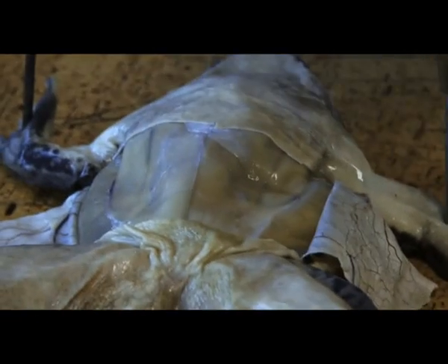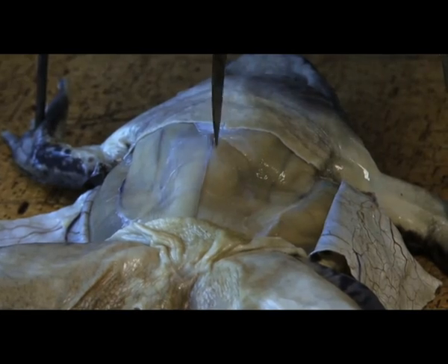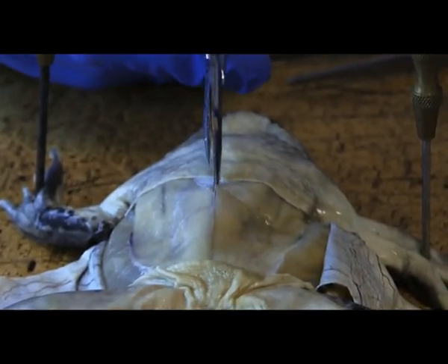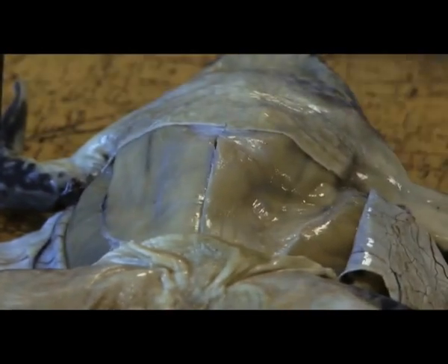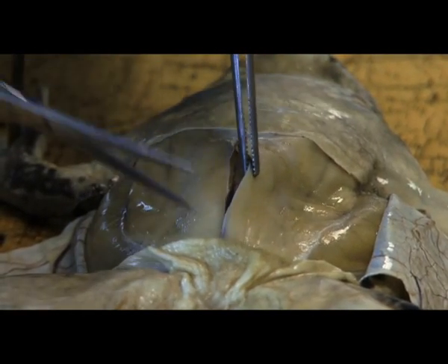We do the same principle again — a very, very thin cut, a small incision, and then straight down the vertical plane. As neat as you can get it; the neater it is, the better you will be able to expose the organs on the inside.